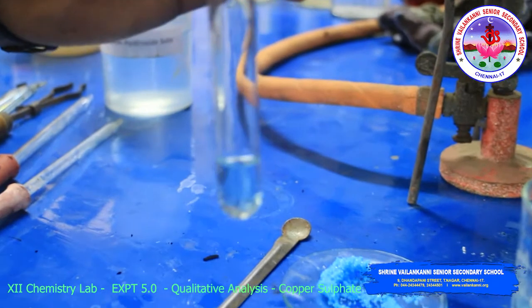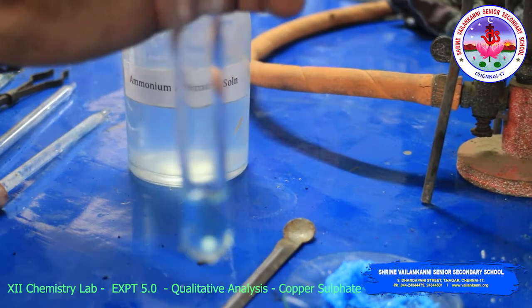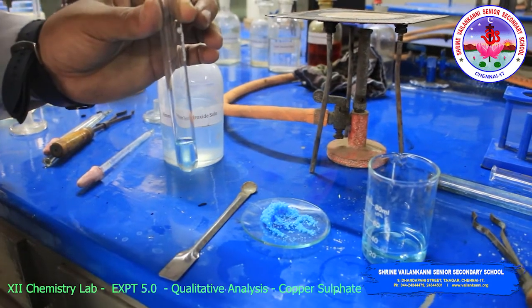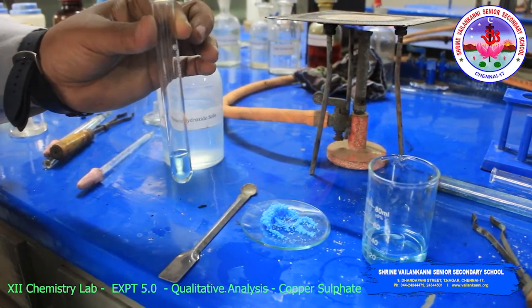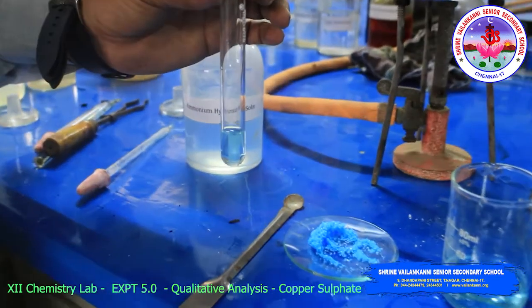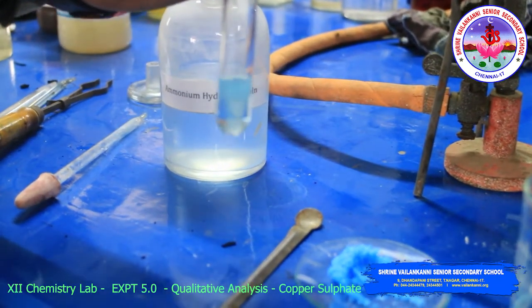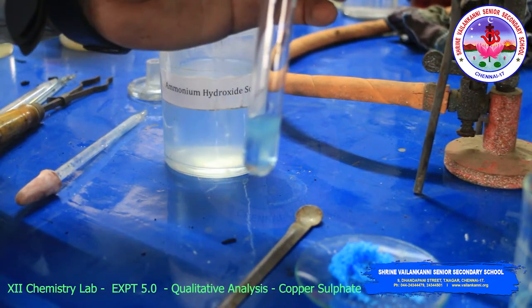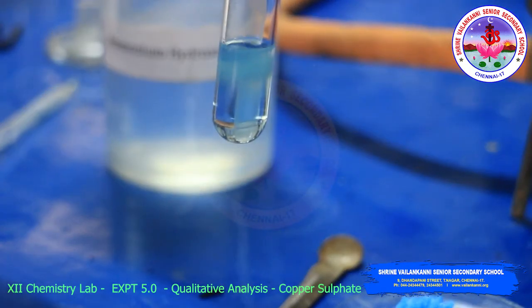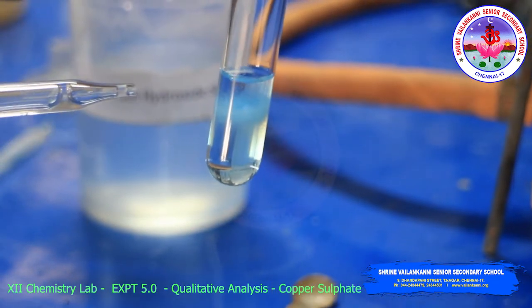Then the test is the ammonium hydroxide test. You have to add drops of ammonium hydroxide to the original solution. On adding ammonium hydroxide solution, a blue color precipitate appears. Can you see the blue color precipitate? The intensity is a little bit less. See, the blue color precipitate is obtained.